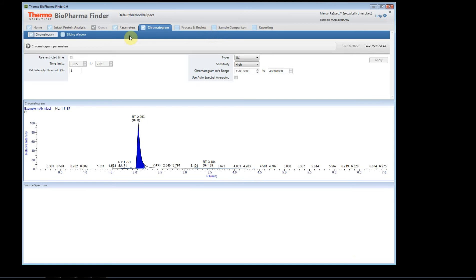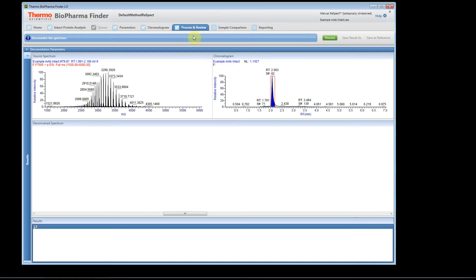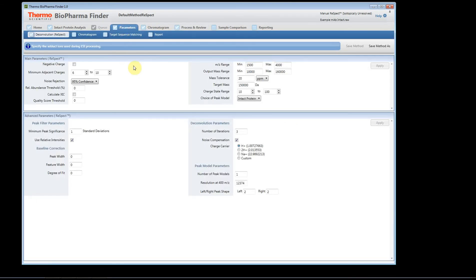Once you've selected a method and loaded it, the software brings you to the chromatogram page. To process your experiment, you need a source spectrum. When using regular ReSpect without sliding window, you must manually create a source spectrum. With the sliding window algorithm, it determines the source spectrum for you automatically. Since we're not using sliding window here, I'll hold the left mouse button down, drag, and create my source spectrum.